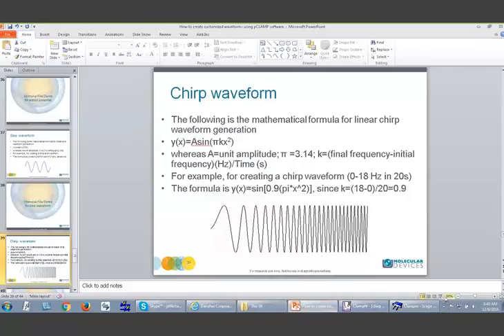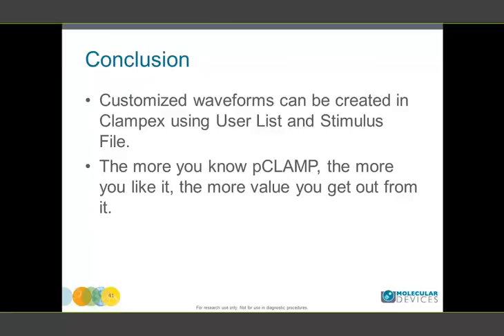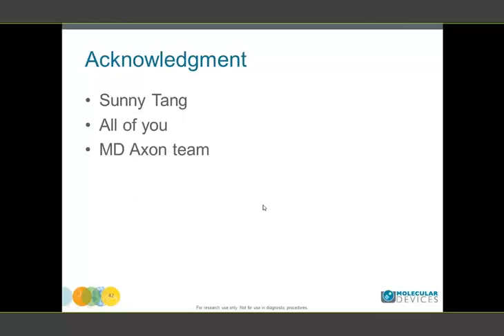The time's almost done. Now, I have shown you how a customized waveform can be created in Clampex using the user list and stimulus file. So my conclusion is that the more you know pCLAMP, the more you like it, the more value you get out from it.